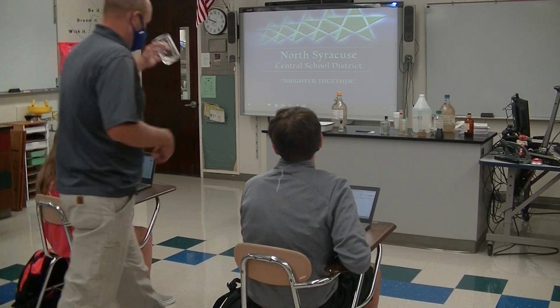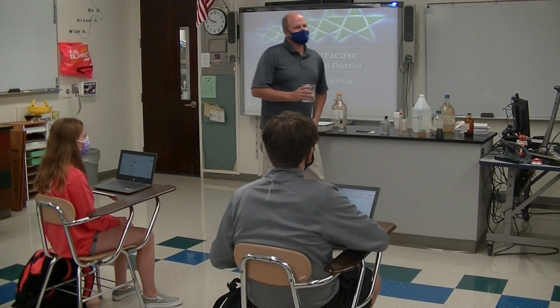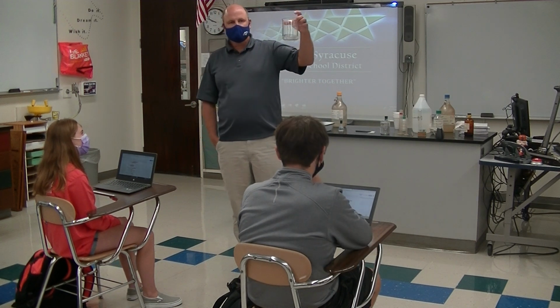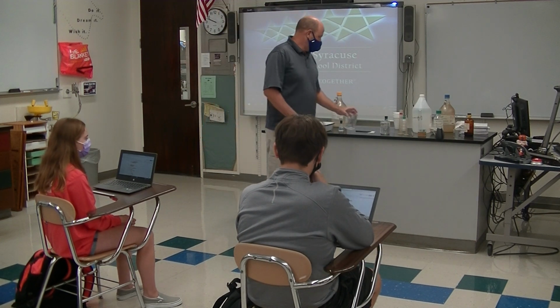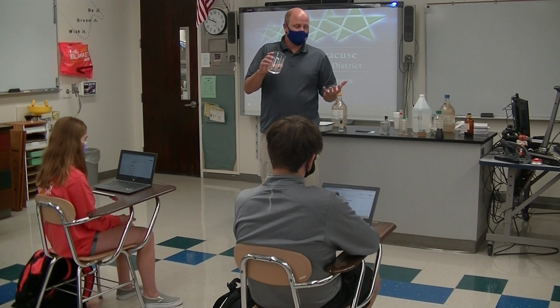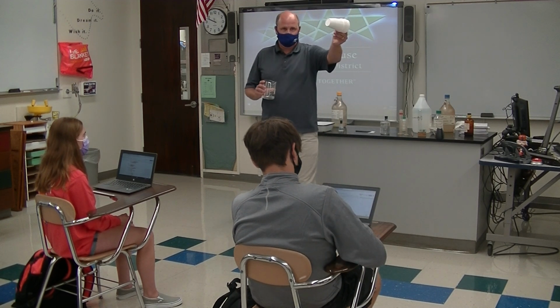This is acetone. You guys know what acetone is? Sharpies are similar to it. That's a good analogy. Nail polish remover. So this is an organic solvent. It's a liquid that's made of carbon. If you do the same thing with gas, do not put gasoline in these.